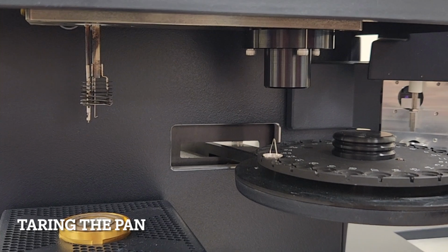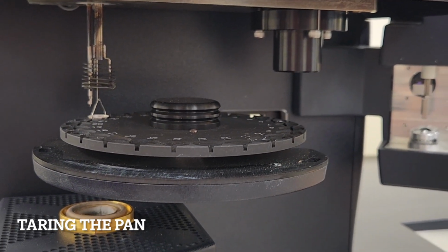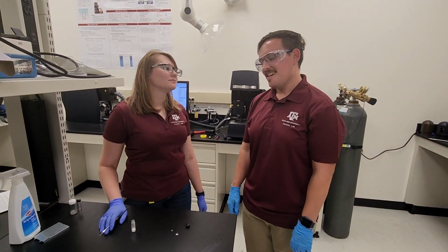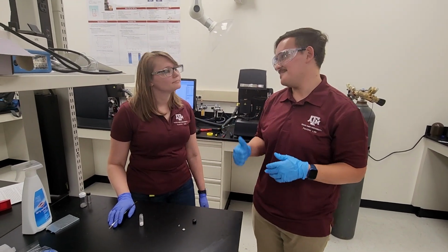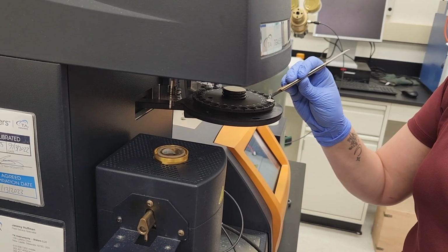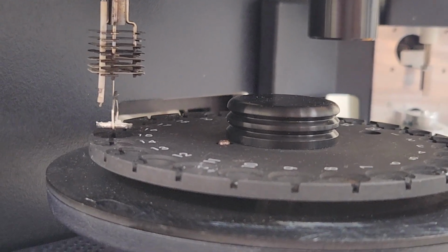This TGA utilizes an auto-sampler. However, most instruments will have an automated loading feature to avoid damaging the hook by manually loading the sample. When the sample pan is loaded, be sure to verify that the pan is not on the tip of the hook and that the pan is level. Now can we load the sample? Yes. In this case, just put enough sample to cover the bottom of the pan. Approximately 5 to 10 milligrams would be the trick. The student will then load the filled sample pan onto the auto-sampler. And just like with the taring process, the auto-sampler will then load the sample pan onto the hook, as such.